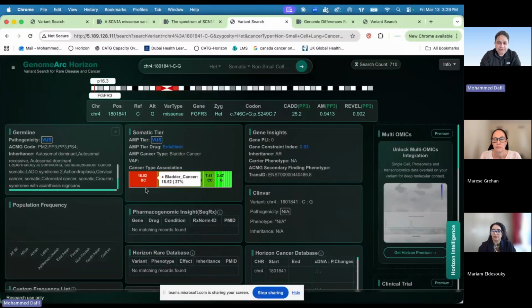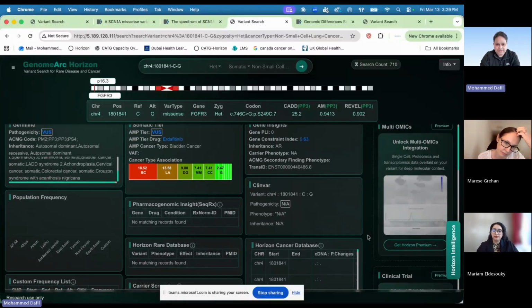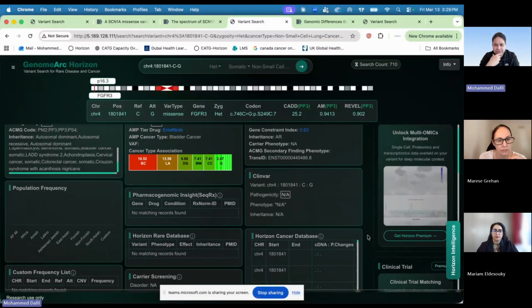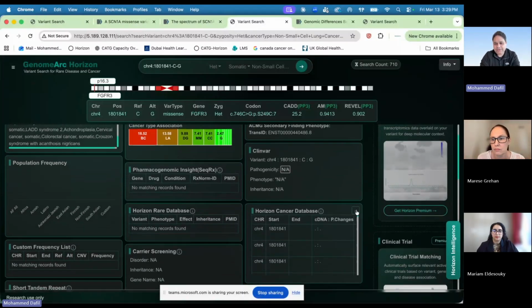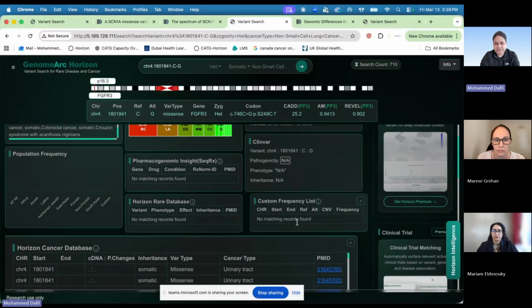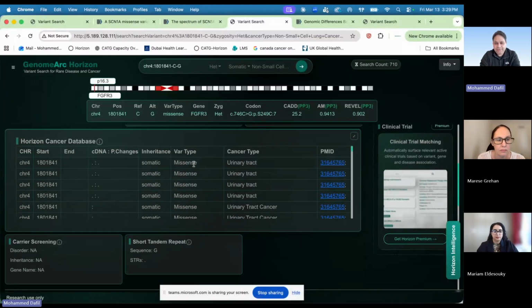I think for different projects, different kinds of databases will show the importance. But at least for me, for example, this particular database shows additional samples that have similar mutations, so that adds a lot of power.